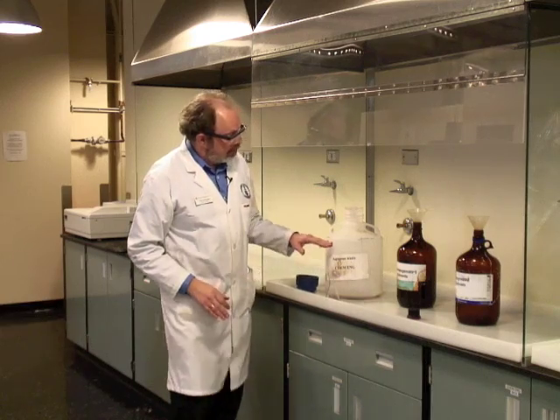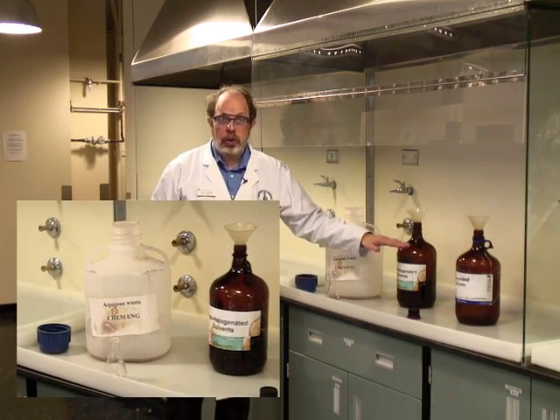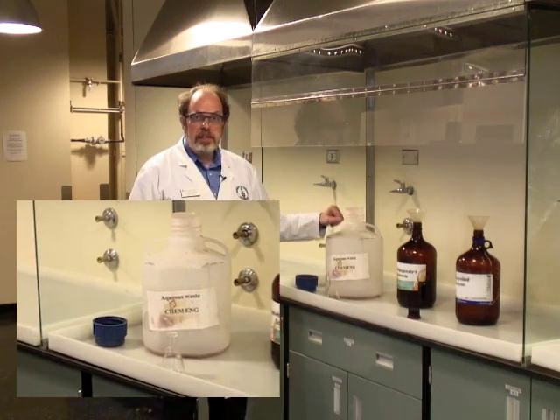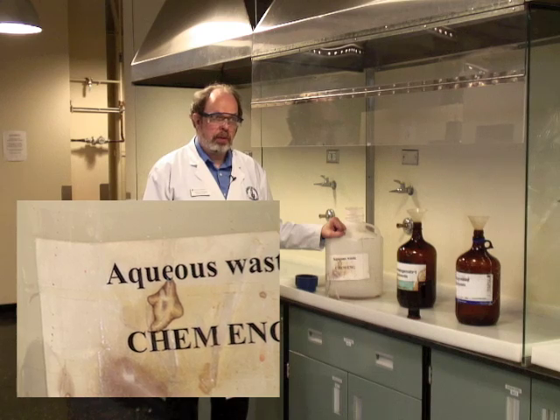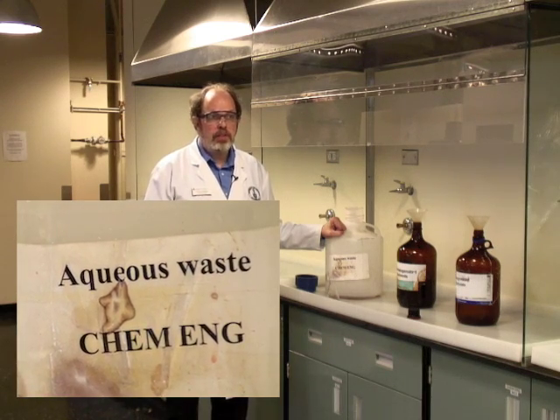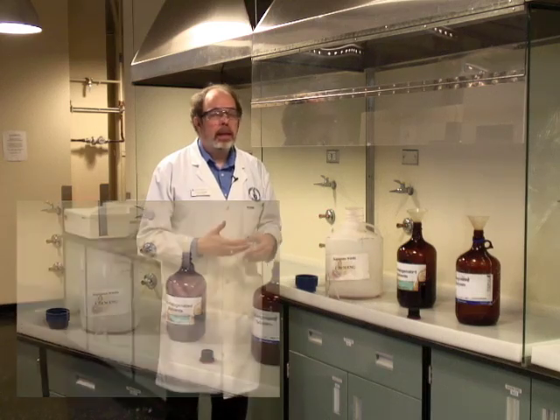Likewise there are fill lines on all of them. Do not fill them above the shoulder of the bottle because there needs to be space for expansion. If you're careful with waste disposal then the dangers associated with incompatible chemicals reacting or spilling is minimized.